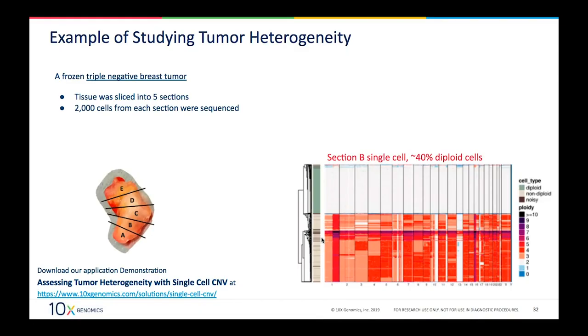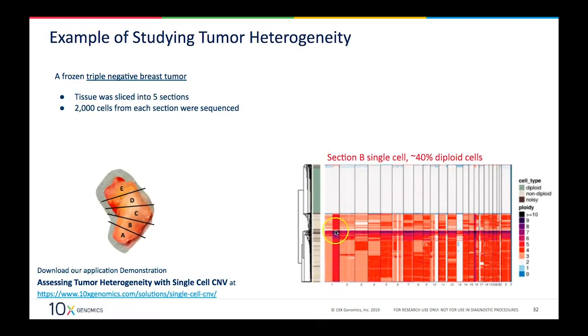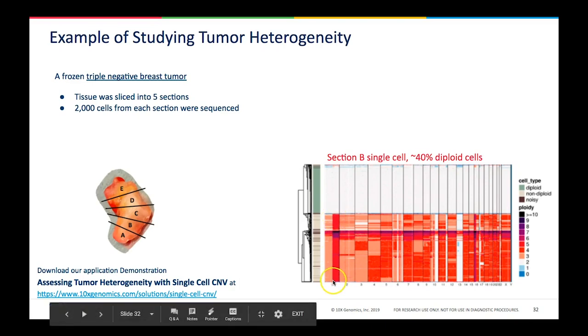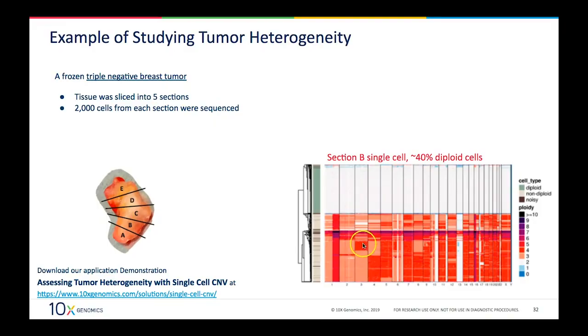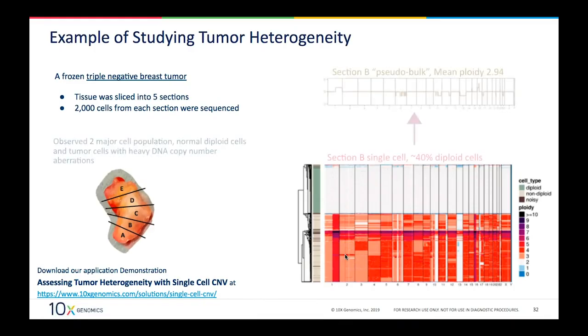And what's really interesting is that just visually you can tell how much clonal diversity there is in here. For example, you can see that the majority of clones here share this copy number 5 of the Q arm of chromosome 1. However, you can see that at chromosome 3, some clones have it at a copy number of 3, and some clones have it at copy number of 4 or 5. So you can see that there are different clones in your population, and it's readily identifiable just by eye.